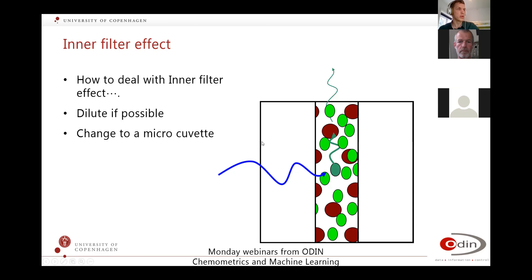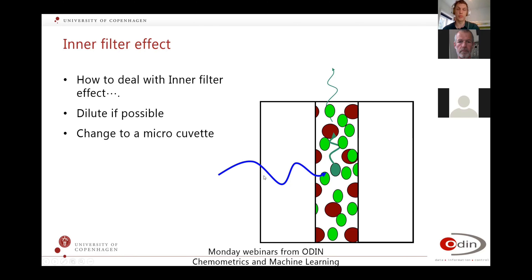How to deal with inner filter effects? One way is to use a micro cuvette, which has a narrower path length in one or both directions. If your biggest inner filter effect is primary, making the excitation path shorter will work fine. If the main problem is in the other direction, you could flip the cuvette. If you have a problem in both directions, you need a micro cuvette that is shorter in both directions, or you need to do something completely different in your measurements.